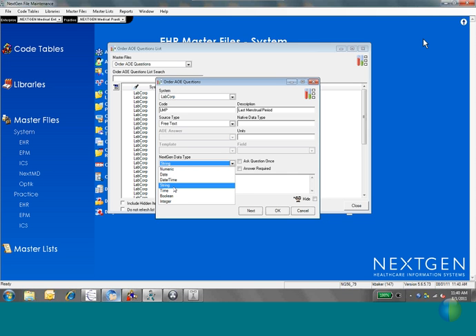String is like a string of characters, so it'd actually be text, might be a better way to describe it. String is where you're just going to type in an answer. It can have letters, numbers, punctuation. It doesn't matter. You can have all of it.